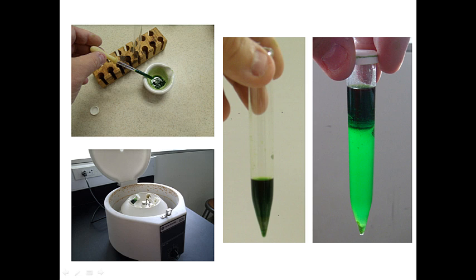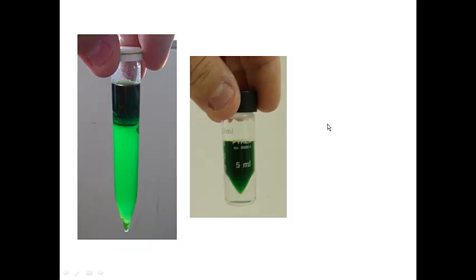After it's been centrifuged, you'll clearly see the 2 layers. You want this top layer to be as dark green as possible. And during the experiment, we'll be checking and making sure that that layer is nice and dark green, because the more pigments, the more concentrated the solution, the better your TLC results are. This isn't glowing. It was next to the window, so you're just seeing the light come in from the window. It's not like it glows in the dark.